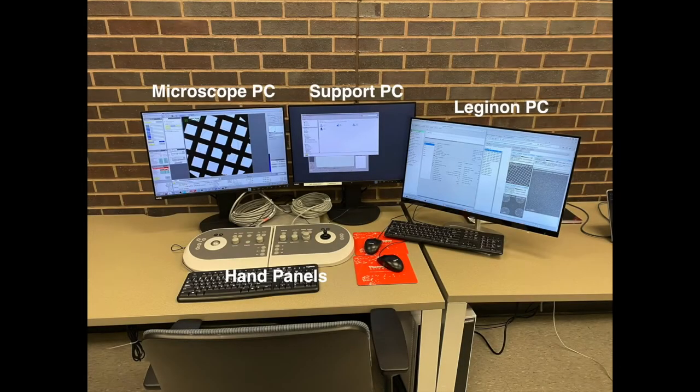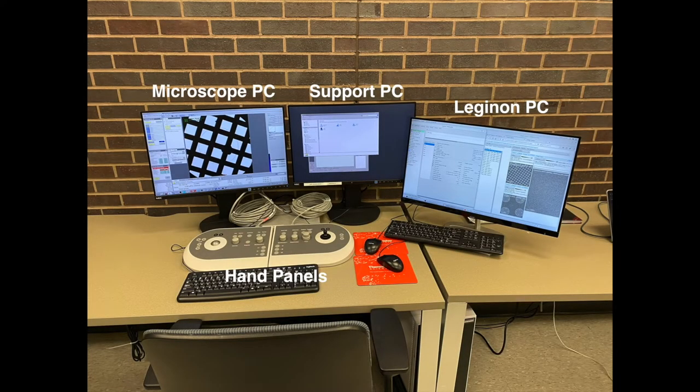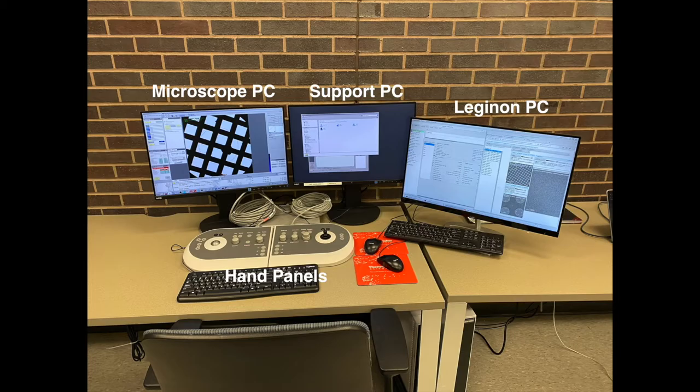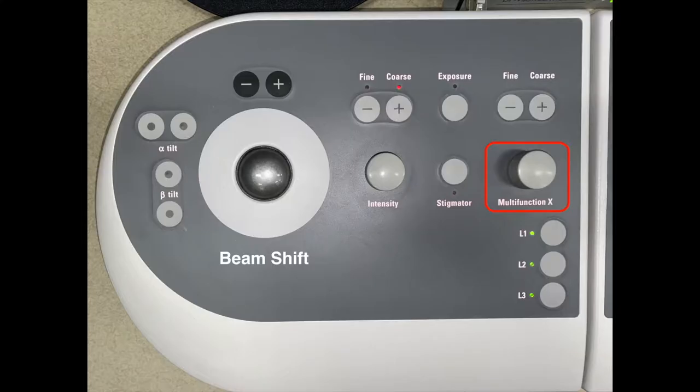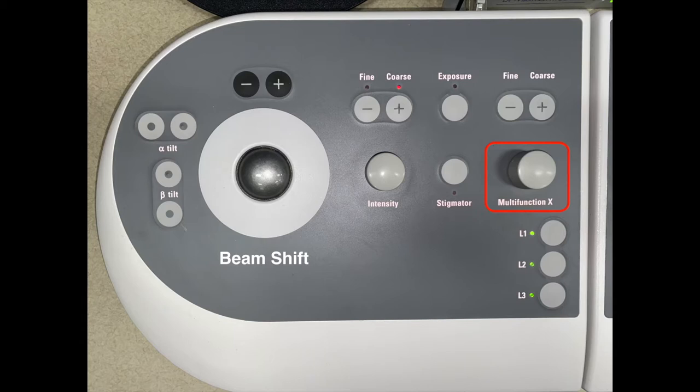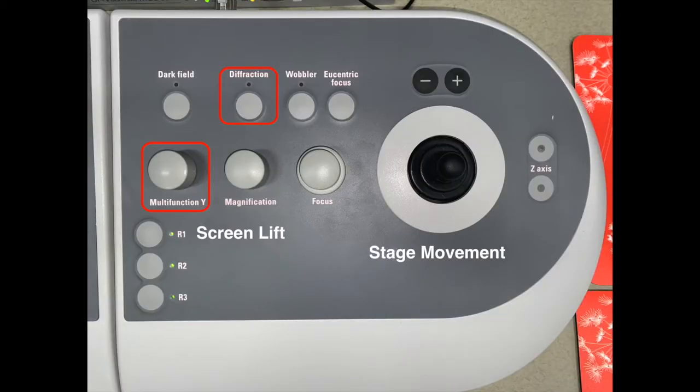In our control room we have our Microscope PC, Support PC, Legenon PC, and hand panels. On our left hand panel the most important function is multifunction X. On our right hand panel we will use diffraction, multifunction Y, stage movement, and R1 for screen lift.